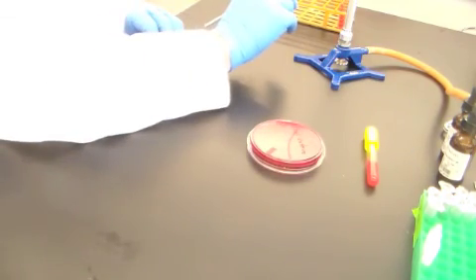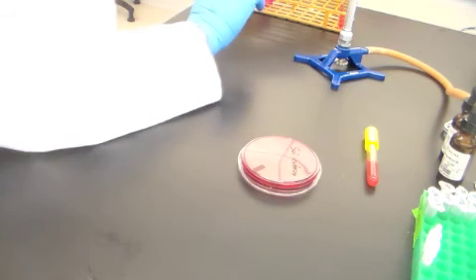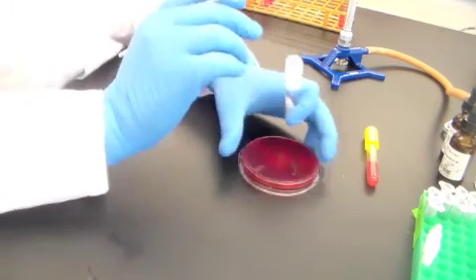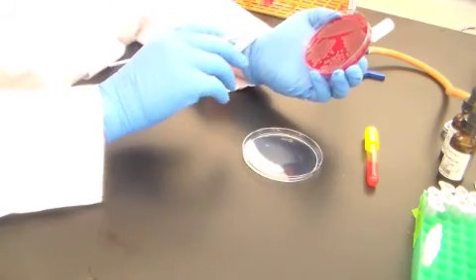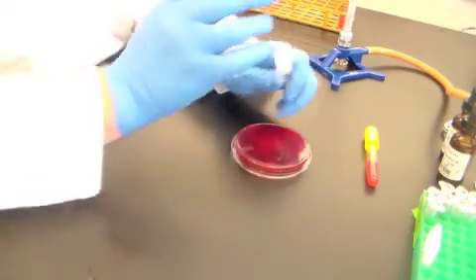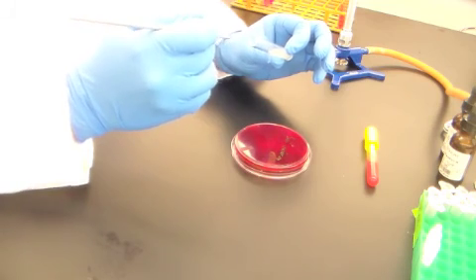The only other media, other than plate media where you're streaking for isolated colonies in week 6, is inoculation of another slant media for another amino acid test, for phenylalanine deaminase. And again, you're going to use your best sterile technique to pick a colony. I'm going to actually go back into that very same colony of Salmonella enterica. Take the needle to stab that all the way down through the butt, through the slant portion.